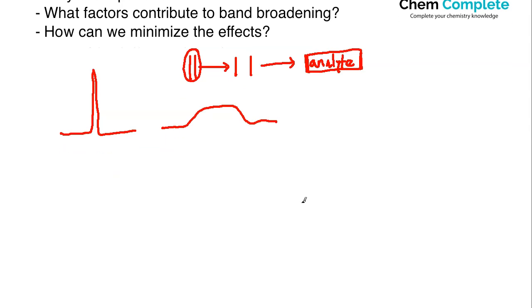So that is not good, okay? If you start having broadening, in other words, let's say that it should look something like this, right? And they're kind of close together, but they're distinct separate peaks. And then you start getting broadening happening, right? Where you've got one, and then the other one, before it really comes back down, starts to shoulder off of it like this, okay? This is far more ideal, this scenario over here, versus this one, right?